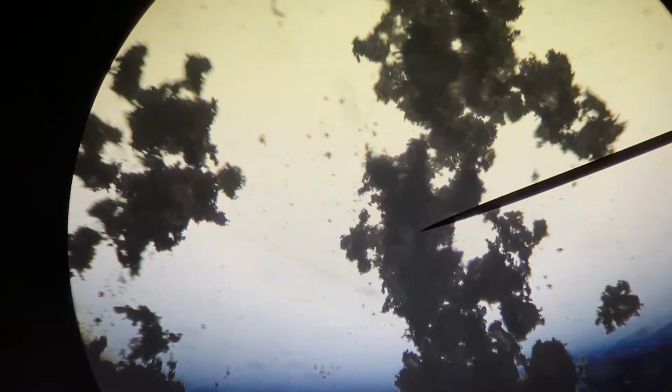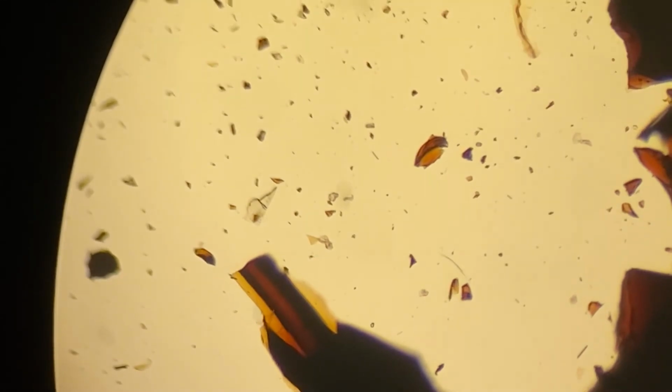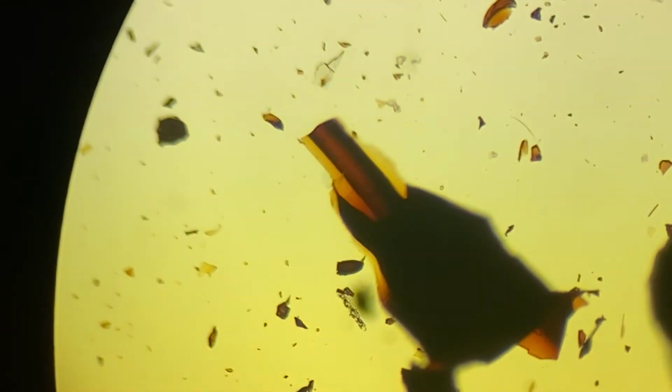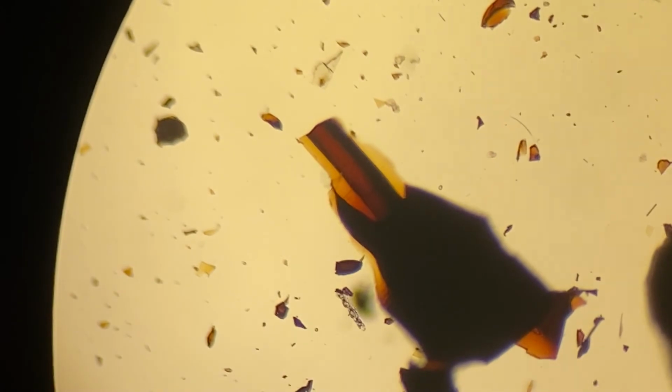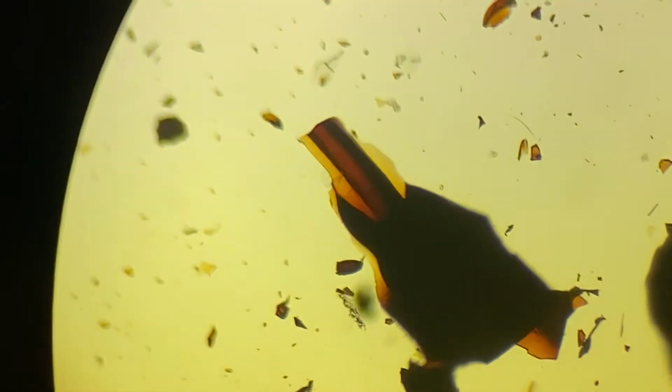There you go. All right, let's see what that black stuff looked like. Remember, after burning the sugar, this is what I ended up with. Interesting. Kind of looks glassy. If you were to take a brown bottle and break it, that's the glass that you would have left over. It's as big as I can make it on camera.